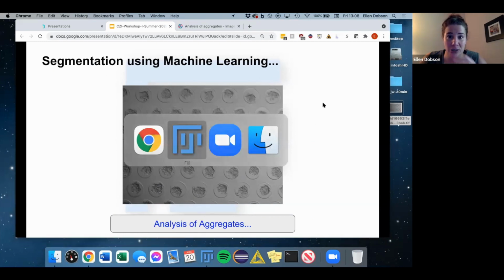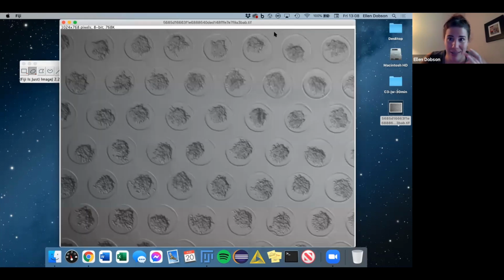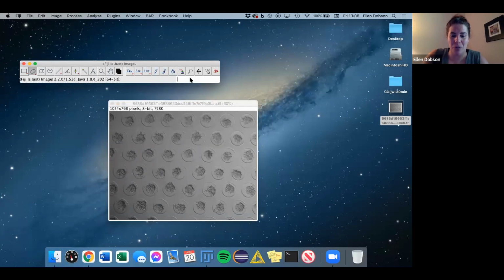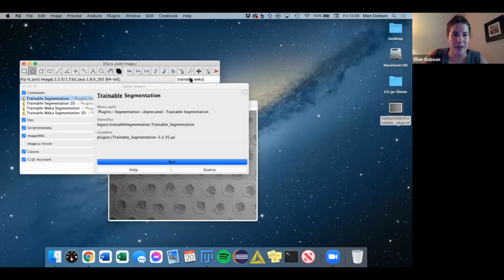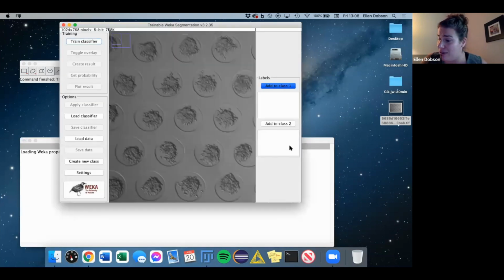I'm going to do a bad drag and drop just for speed purposes. And then if you just type in the search bar, Trainable Weka, it takes a minute to load. Plus my internet's a little bit slow.